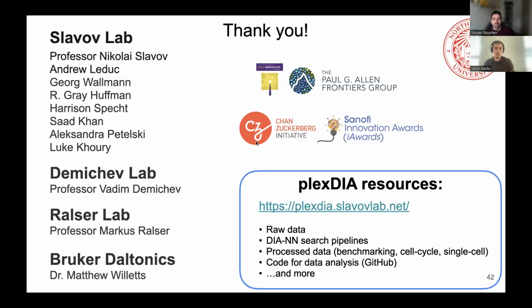any of the precursors that you get. The reason being is that you're quantifying the window that you get when you analyze precursors in parallel with isobaric mass tags. You don't actually quantify each distinct precursor. So it's not really amenable to doing isobaric analyses. But if you're discussing using isotopologous TMT Pro, like TMT Pro super heavy, you could potentially multiplex that with mTRAQ, but the thing is, they're not going to elute at the same time as something like mTRAQ.